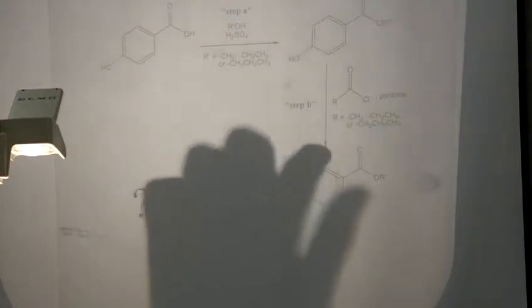The way this ester forms is there's actually a carbon here and then this R group off of here to make the ester. The R is pertaining to just this group here. So we want a methyl here, not meaning that we've only got one carbon here. For the methyl, we would actually have 2 carbons, okay?